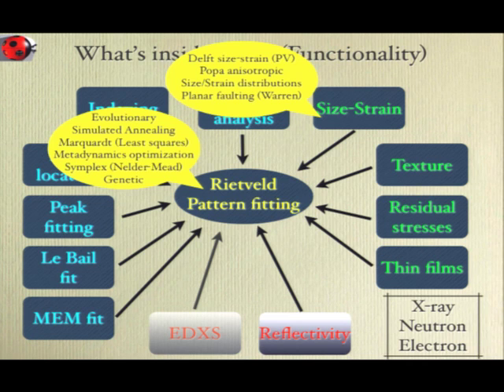So you can use MAUD without any assumption on the peak shape. Well, I would say you don't make any assumption on the peak shape, but you do on the distribution, because you choose, I have a log normal distribution, or I have another kind. So simply the assumption goes to another level. It is a little bit slower, but when you have a complex shape or a bimodal distribution, then it really fits very well. Okay, and planar faulting, yeah, here, or the single layer, for example.